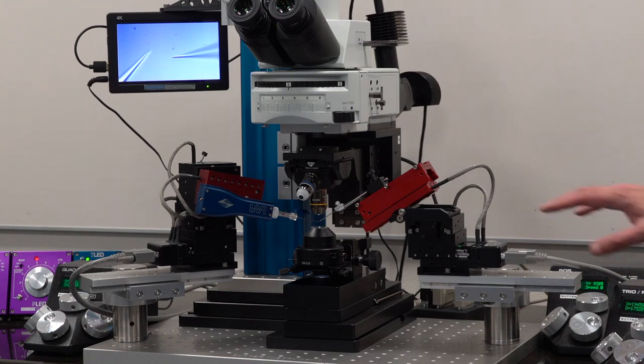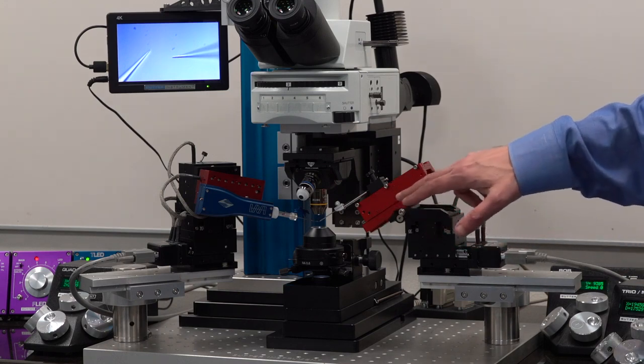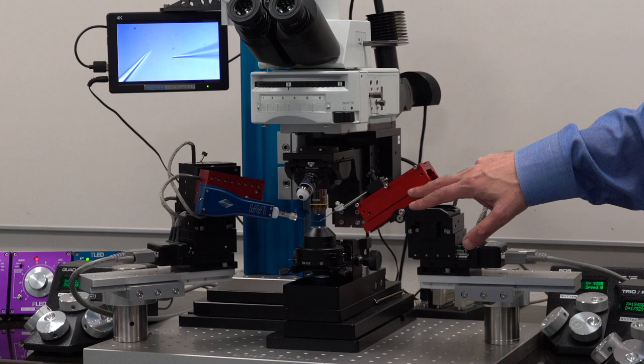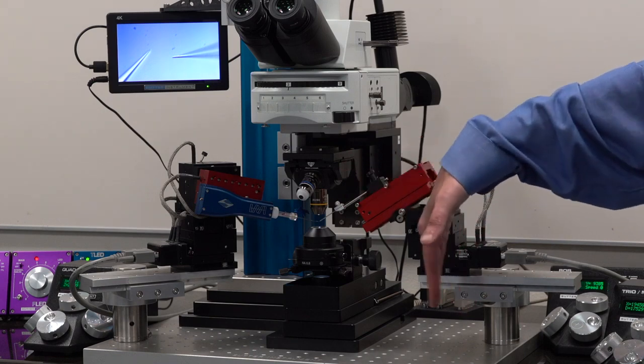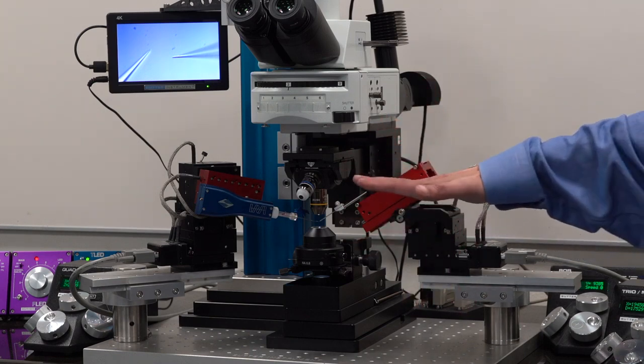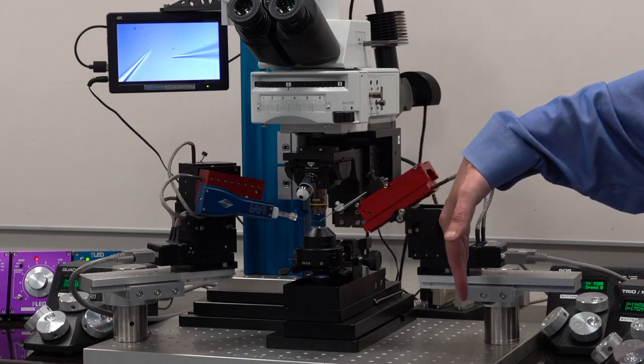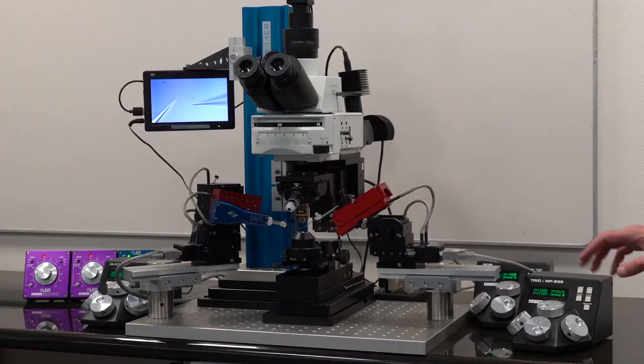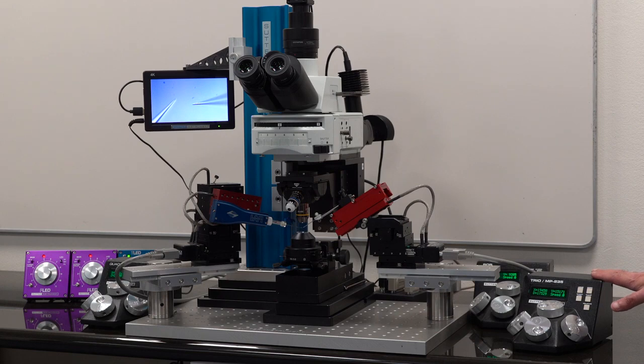I've had customers that this 50mm D axis here can get angled any way you want from completely horizontal to completely vertical. And very, very simple controller.